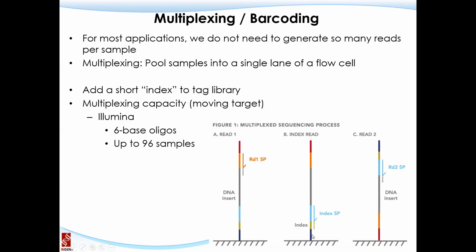After doing that, if you want to do paired end, you turn the DNA to the other side. You can see that the red is on top, and then you turn the DNA and make it so the red is at the bottom, completely rotated. Then we have the sequencing primer target this and sequence the DNA molecule from this end.